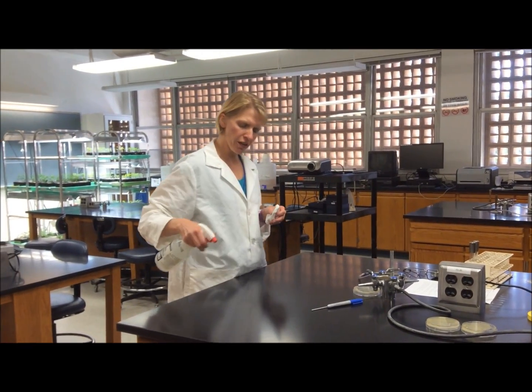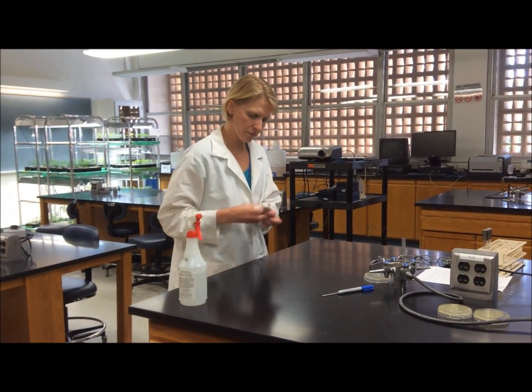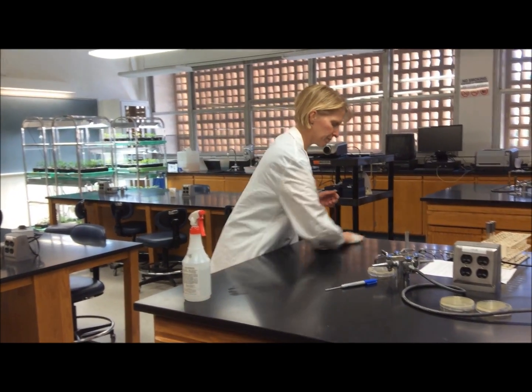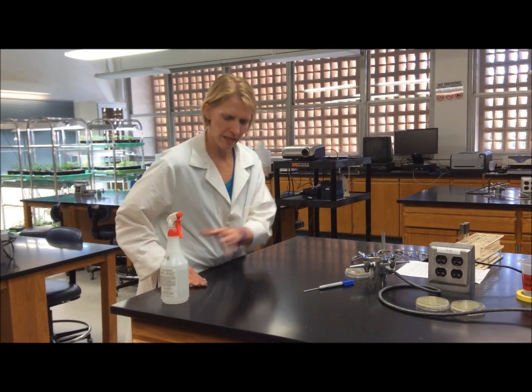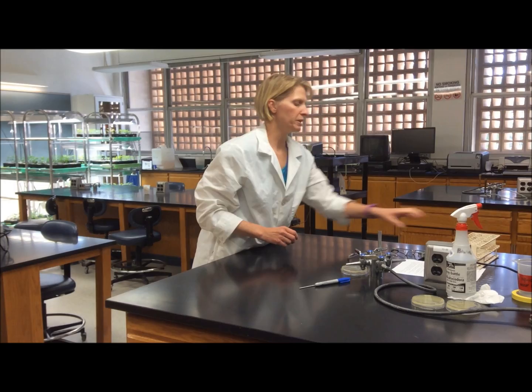So before you begin working with your bacteria, you want to clean your work surface with 70% ethanol. Next, gather up the materials that you will need.